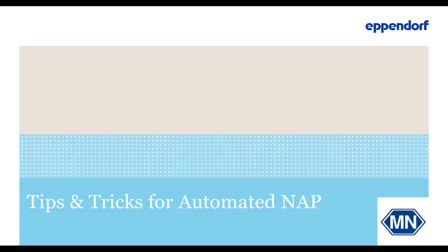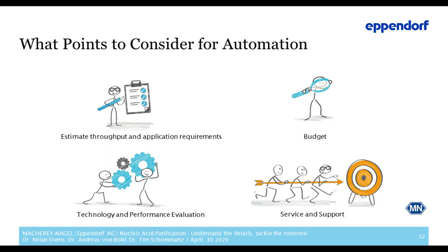And with that, I wanted to come to the next topic, which will be the tips and tricks for automated nucleic acid purification. So the session before was more specific to MACHEREY-NAGEL kits, and now it's a more general recommendation if you're going for automation for nucleic acid purification. Tim already spoke a little bit about it.